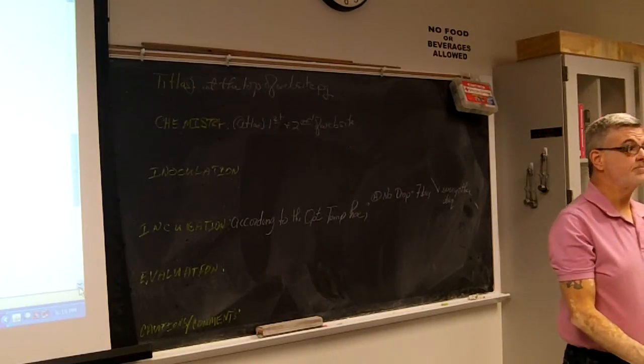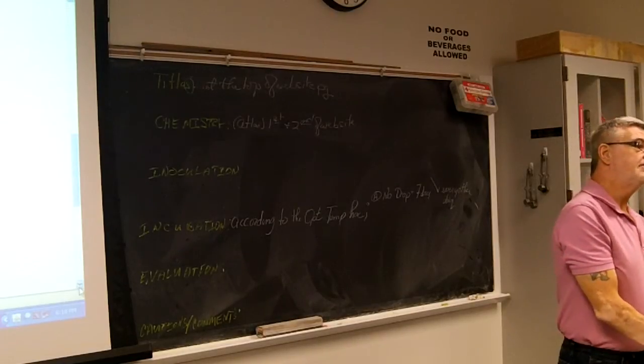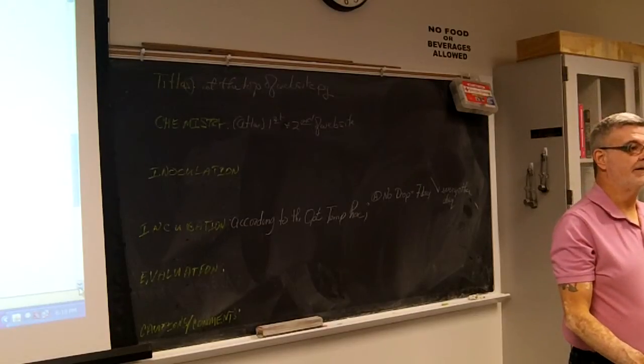If it is positive and it doesn't have gas, you write down slow positive without gas. If it does have a bubble, you write down slow positive with gas. What if it's still not positive? You write down negative. You're done. Get rid of it.